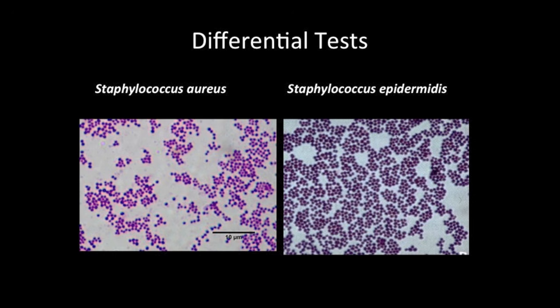Biochemical tests, also referred to as differential tests, are important tests that allow us to evaluate differences in metabolic processes between species. While two species may look very similar under the microscope, they may be very different metabolically. We will be evaluating one type of biochemical test in the next lab session. You will be observing a carbohydrate fermentation test. Let's explore what carbohydrate fermentation tests are and what information they provide us with.